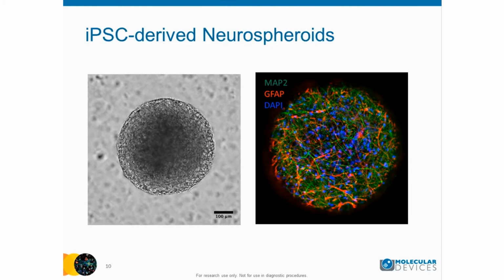The methods for imaging spheroids were previously described, but typically this is a stack of 10 to 20 images taken separated by 5 to 10 microns, starting from the bottom of the well and moving up. All individual images can be saved and used for 3D analysis, or analysis can be done using a 2D projection image.